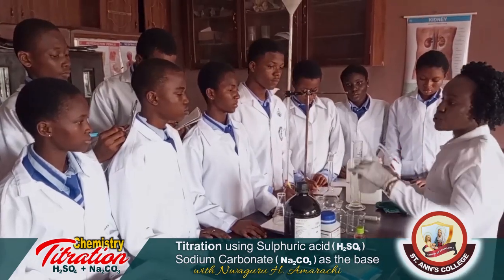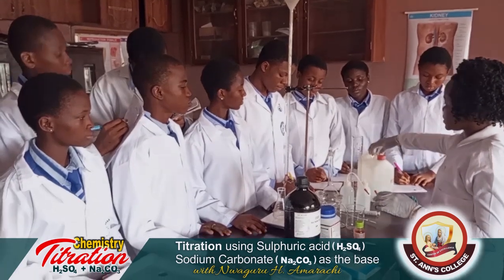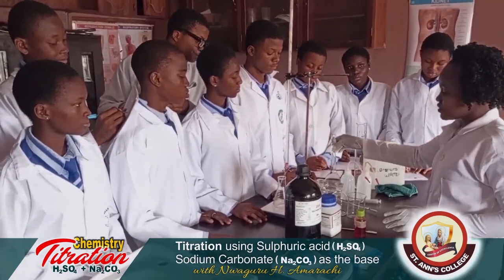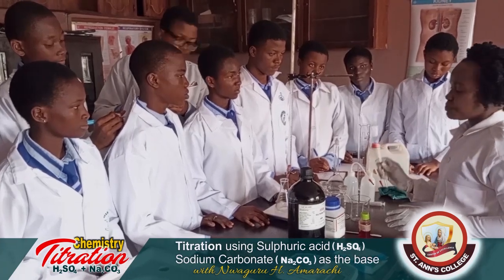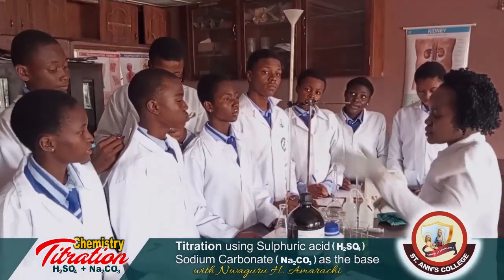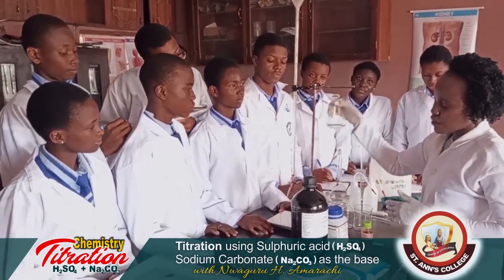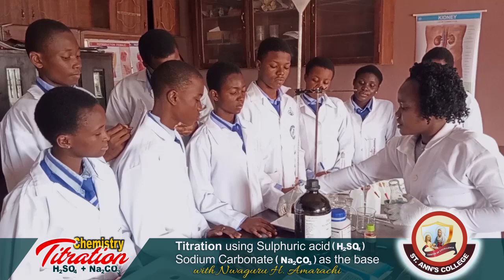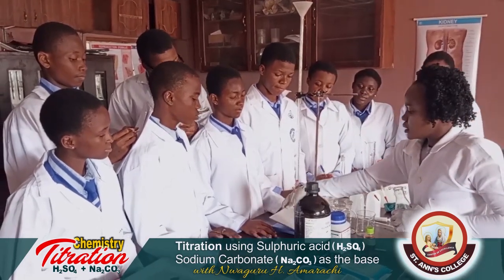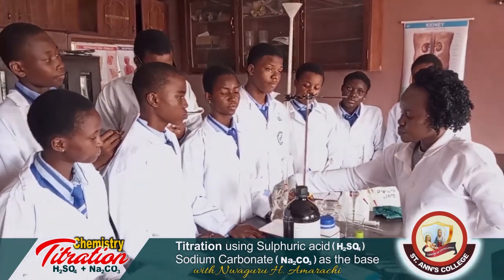These are our wash bottle with our distilled water, our measuring cylinder, volumetric flask. This is a pipette. We have our funnel. We have our burette. This is called a retort stand, with our conical flask. I believe you still remember the work of this. Yes, the white tile. It enables us to see the clear color change. Good.